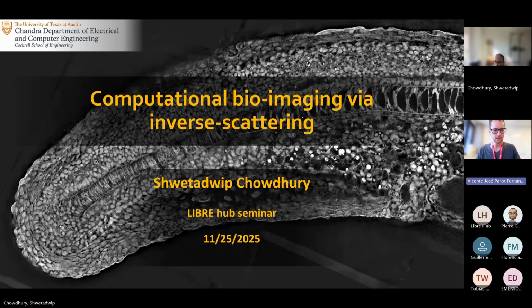As you may know, in our open hardware project, we are teaching how to build low-cost instrumentation for microscopy, and computational methods are important because nowadays more and more techniques use complementary complexity in the computation in order to gain what's more simple in hardware.